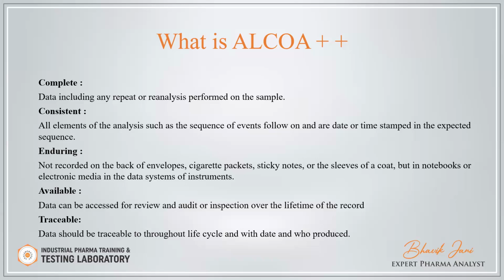So data should be recorded in your CGMP notebook or electronic media, which is issued and authorized by the QA. Data should not be captured in any non-GMP document. Data can be accessed for review and audit or inspection over the lifetime of the record. Data should be accessed for review whenever the auditor requires or whenever the data is required for review.